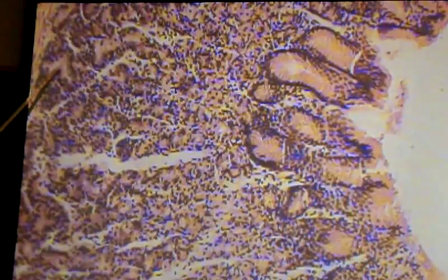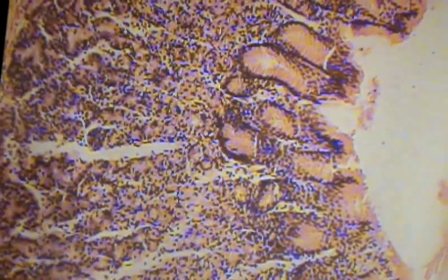Once you get into these structures, I know you can't see it, but off of the gastric pits are little tiny channels that radiate into the rest of the mucosa layer. All of this is gastric gland, and the glandular secretions will be transported through these little tubes eventually into the gastric pits, which will then lead into the lumen.